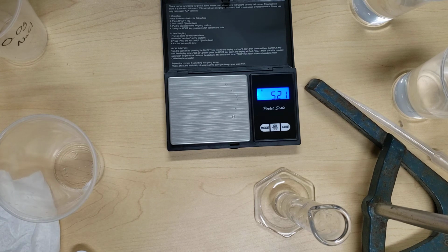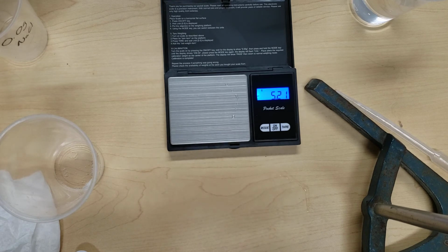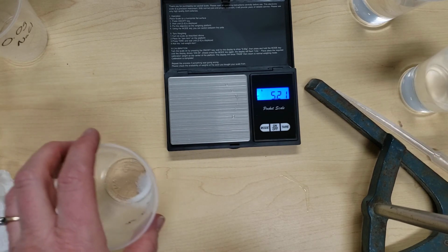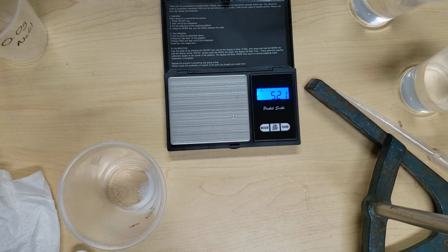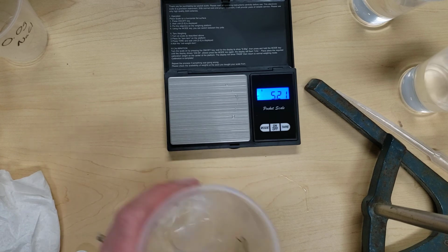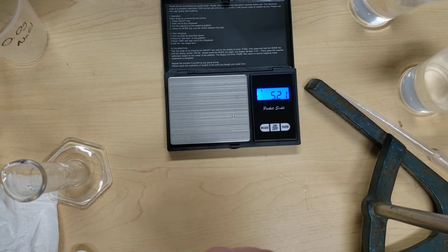All right. We're going to fill our graduated cylinder with 10 milliliters of clean water, and we're going to add it into our 0.75 grams of salt. Make sure that it dissolves.